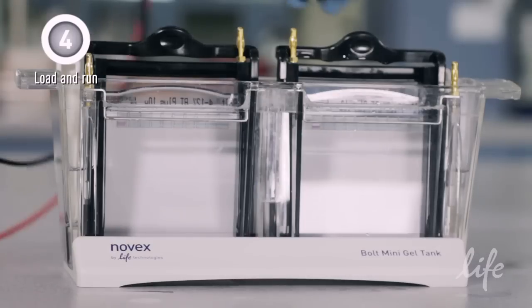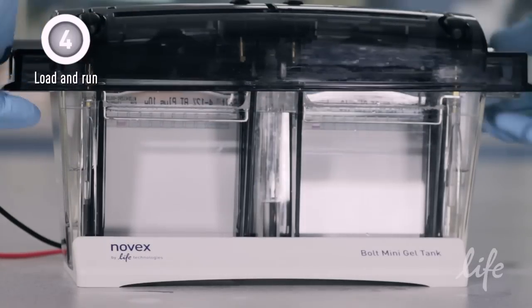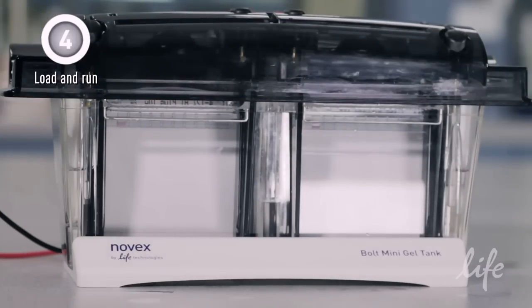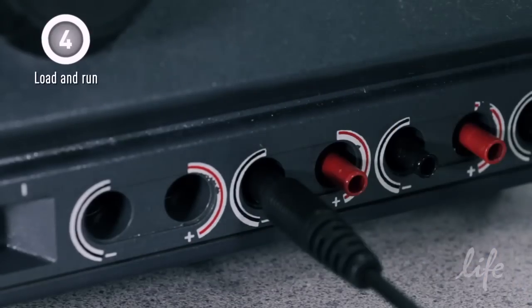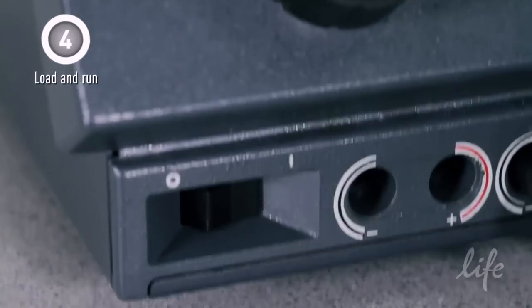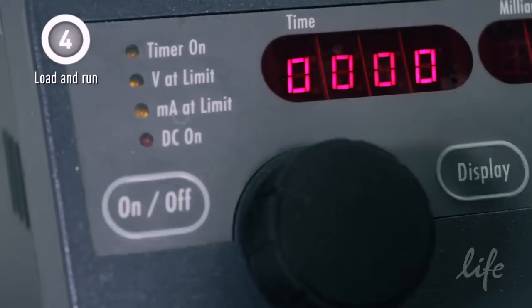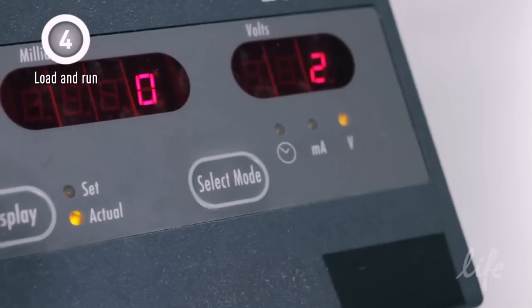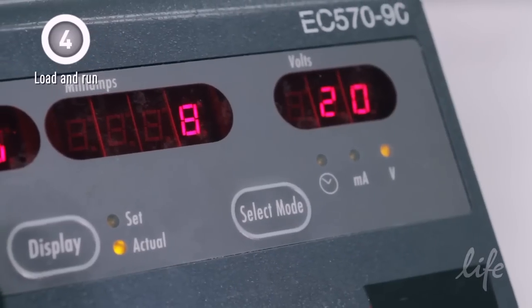Place the lid on top of the tank and align the electrodes over the corresponding banana plugs. Connect the electrode cords to the power supply. Turn on the power and press start. Set the power supply to a constant 165 volts.